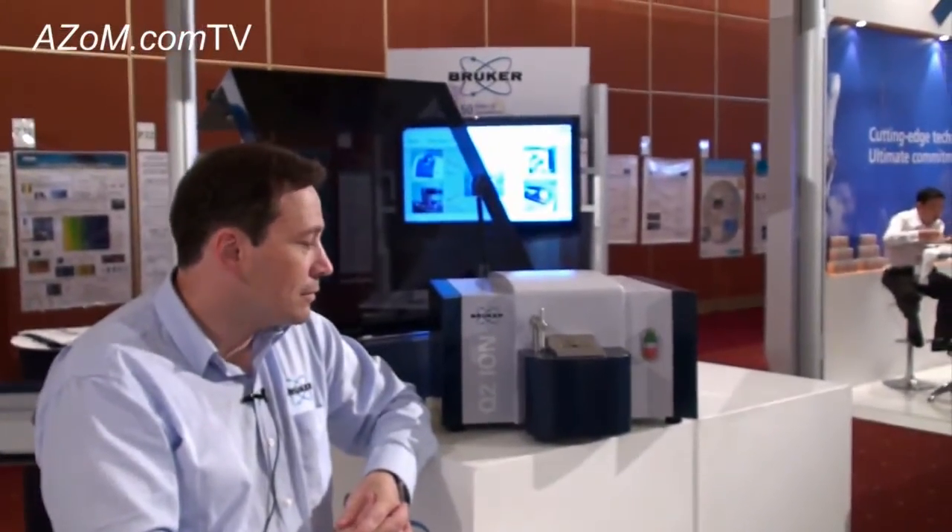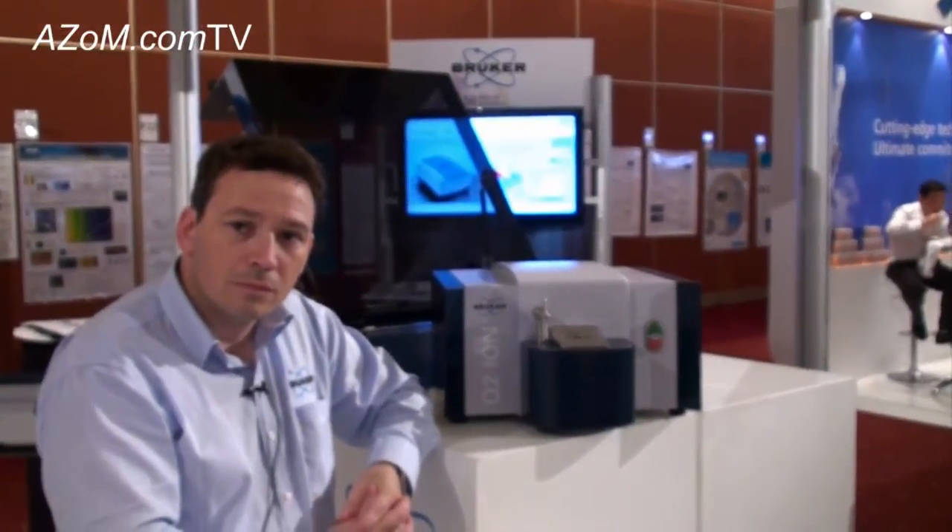This is Cameron Chai from Azon, bringing you another episode of Azon.com TV. Today we're speaking to Neil Hughes from Brooker, and he's going to be talking to us about the Q2 Ion Optical Emission Spectrometer.